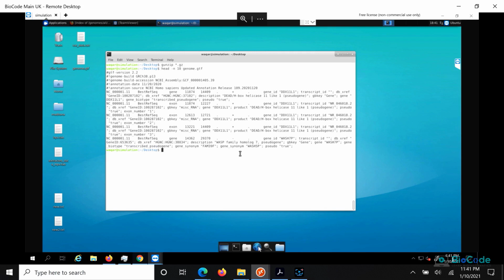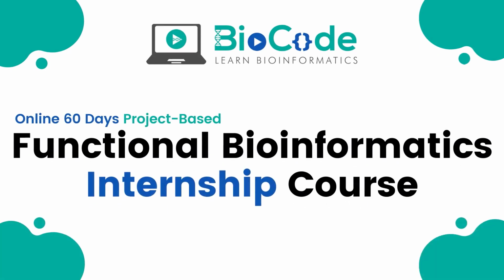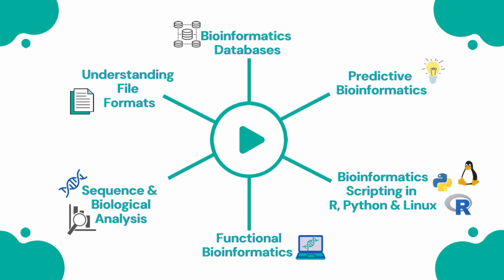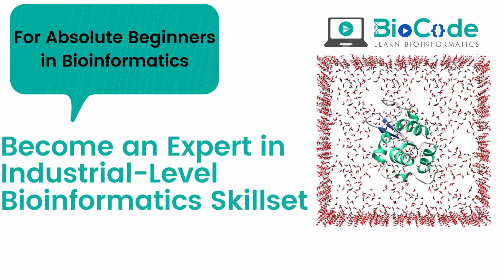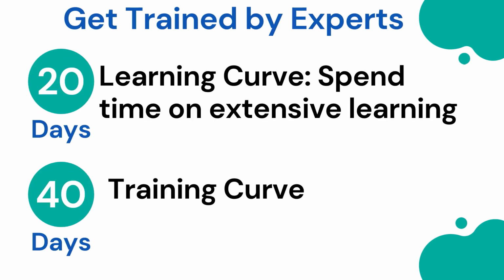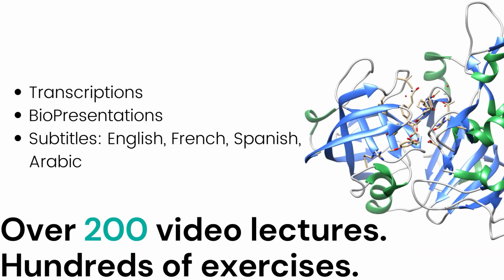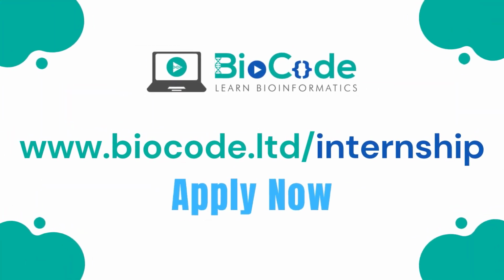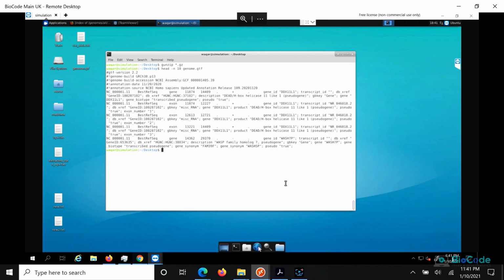So first of all, what you need to understand is that there are multiple columns, as you know, and in this video what we are going to see is how we can actually extract useful data out of that, and basically we are going to count the features that are available in this data.